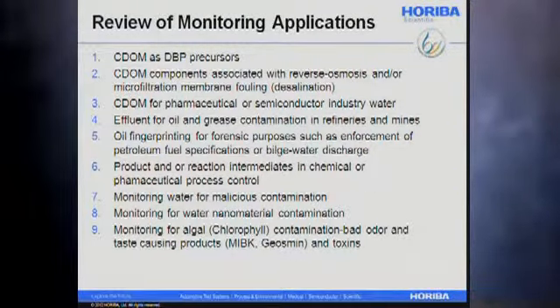Okay, so just some of the applications as a review here. CDOM is disinfection byproduct precursors. There's also a lot of interest in wastewater treatment and desalination for evaluating membrane fouling, micro and reverse osmosis membrane fouling. In the semiconductor and pharmaceutical industry, the total organic carbon levels have to be monitored. Oil and grease contamination in refineries and mines. Oil fingerprinting.